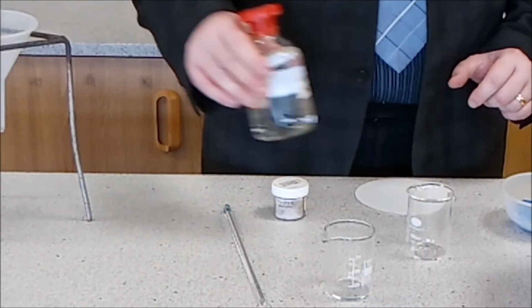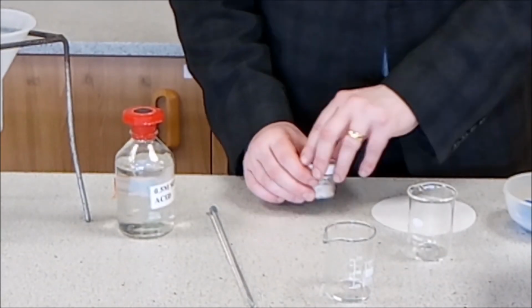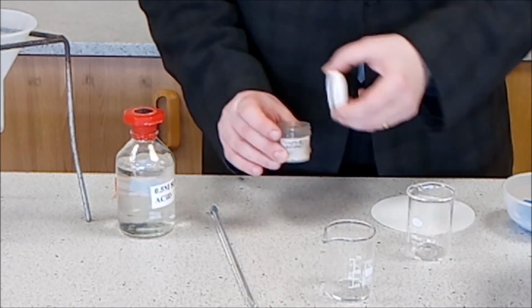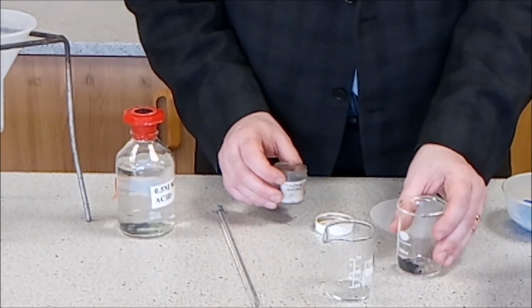To make copper sulphate, the first thing that we need to do is measure out. When you do this, you would use a spatula, but measure out an excess of copper oxide, because it's the copper oxide that you are going to react with sulfuric acid.